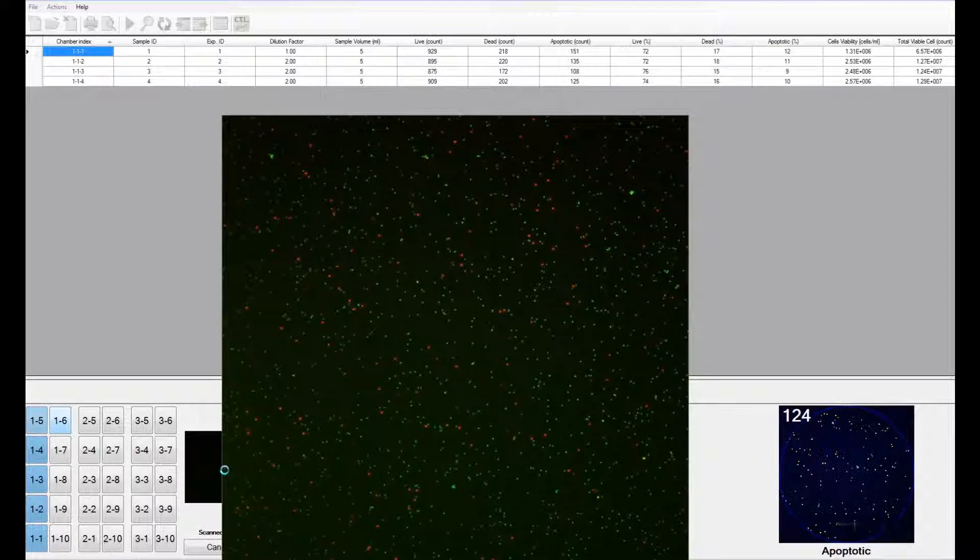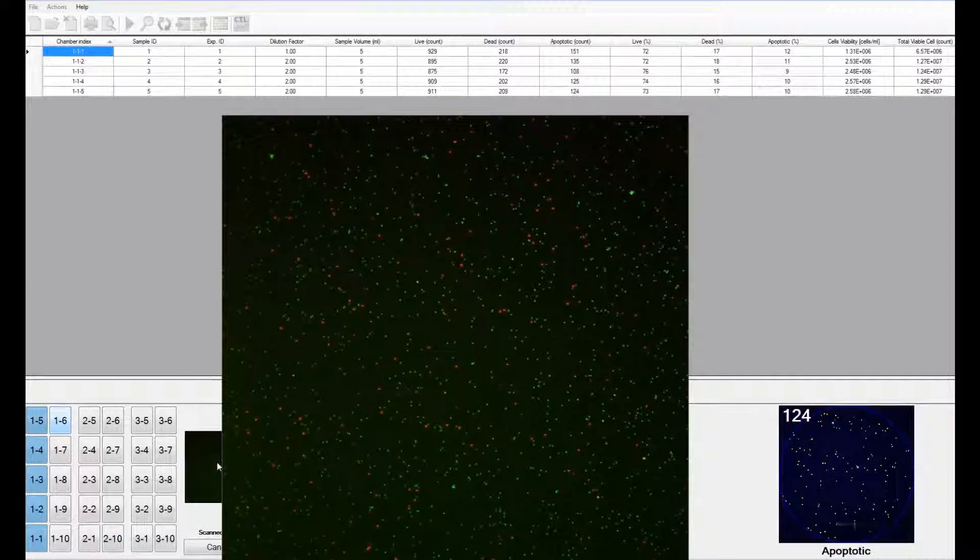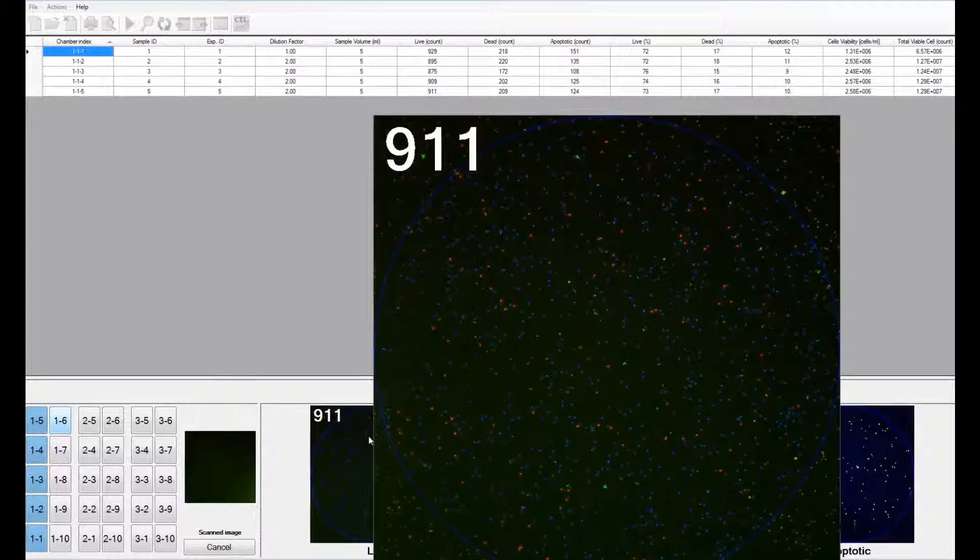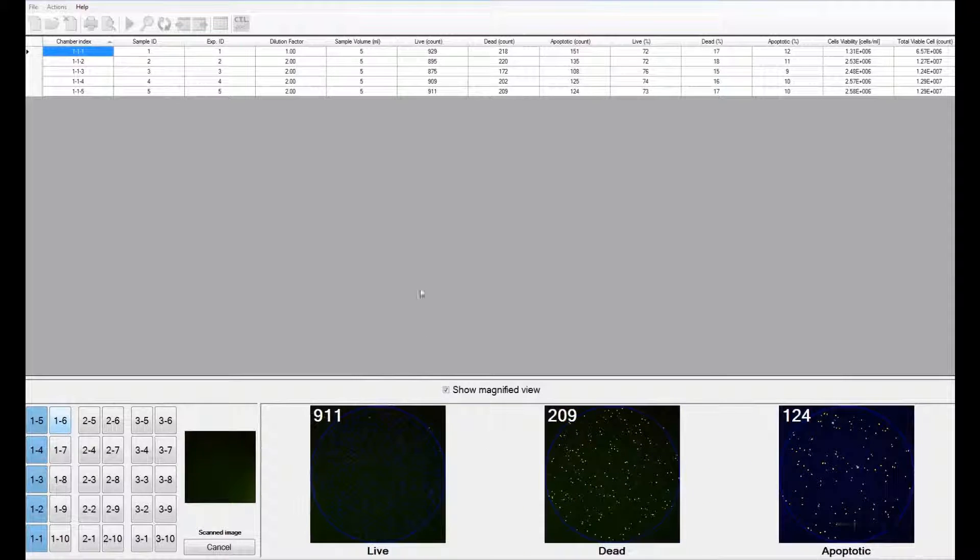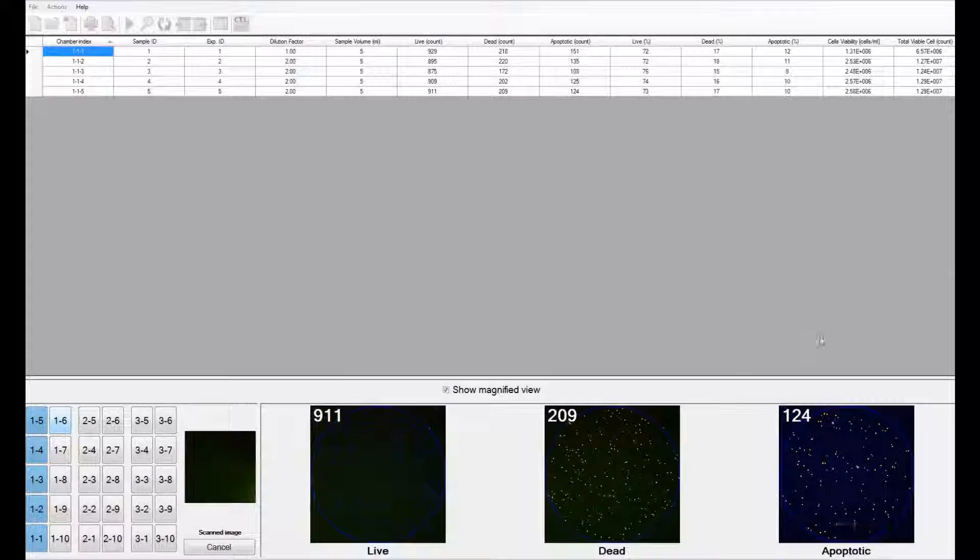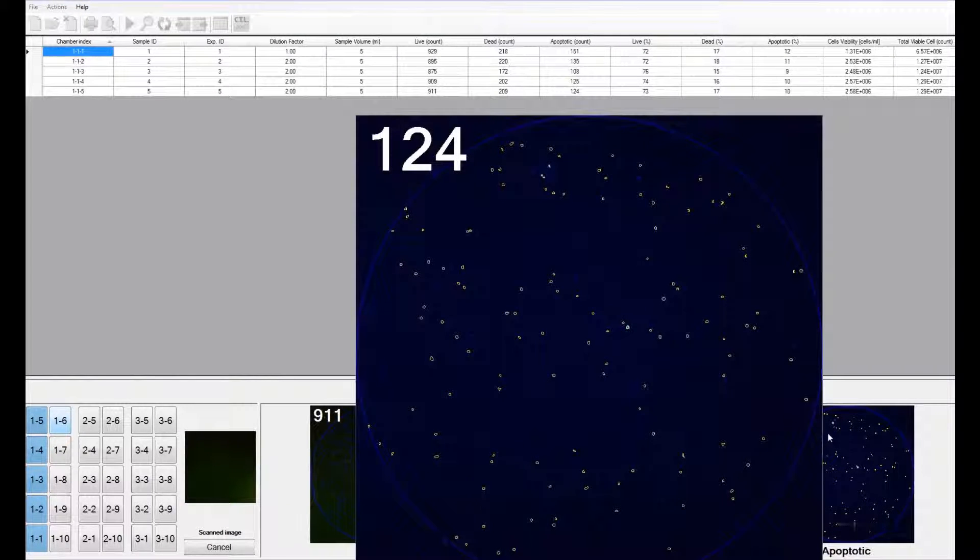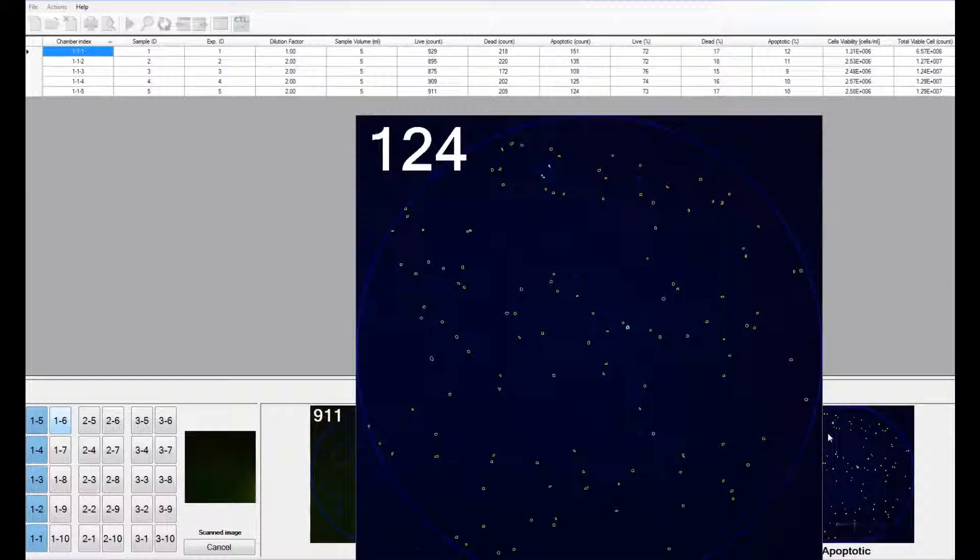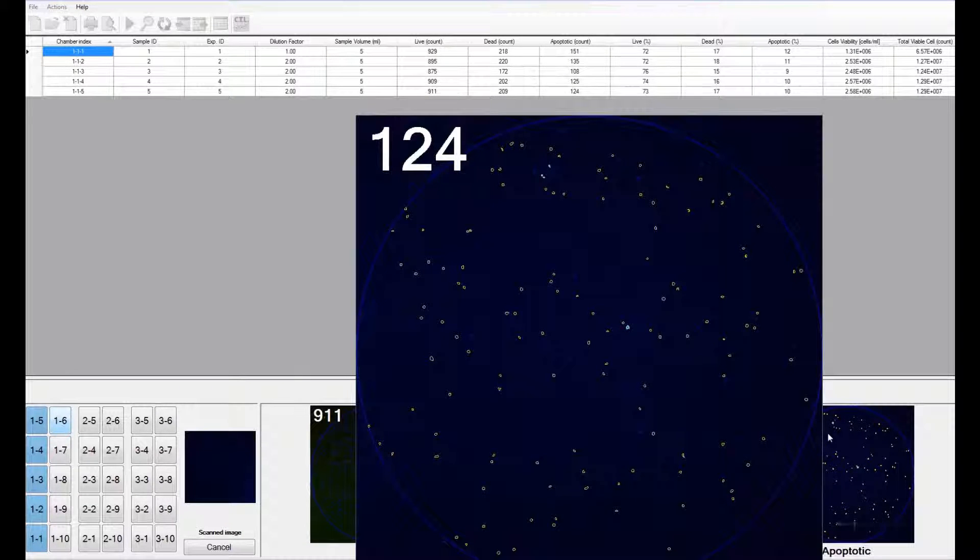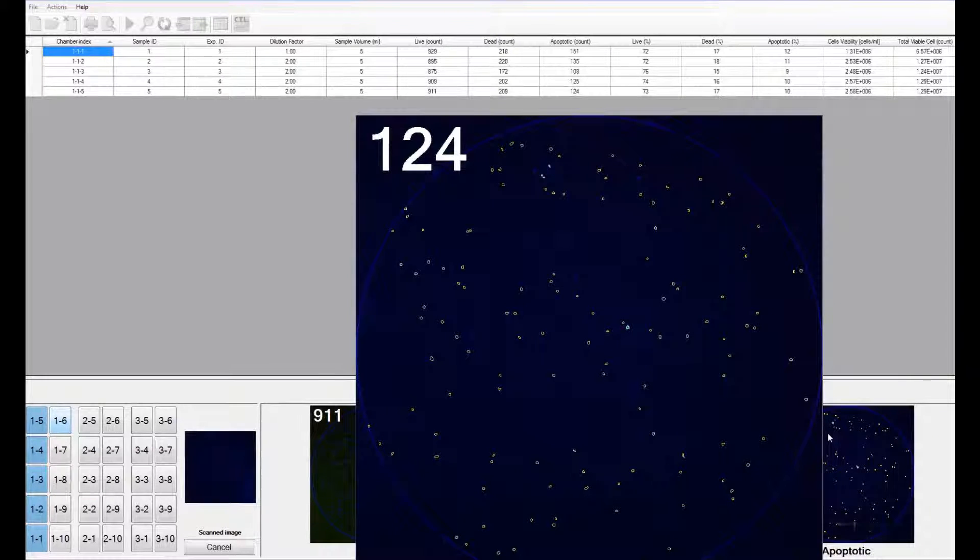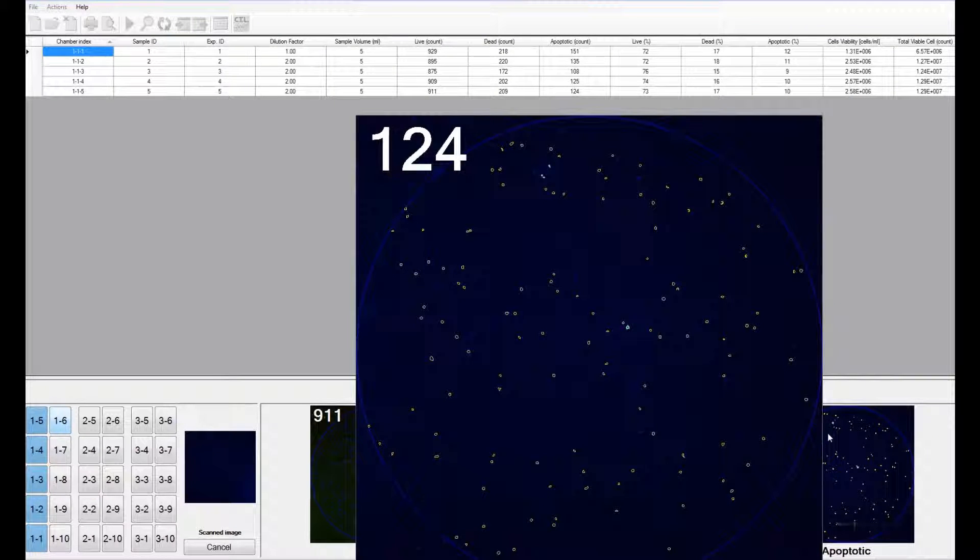You can view the live count, the dead count, or the apoptotic count. On the counted live, dead, and apoptotic images, you will see circles that are overlaid. These are the cells that are being counted.